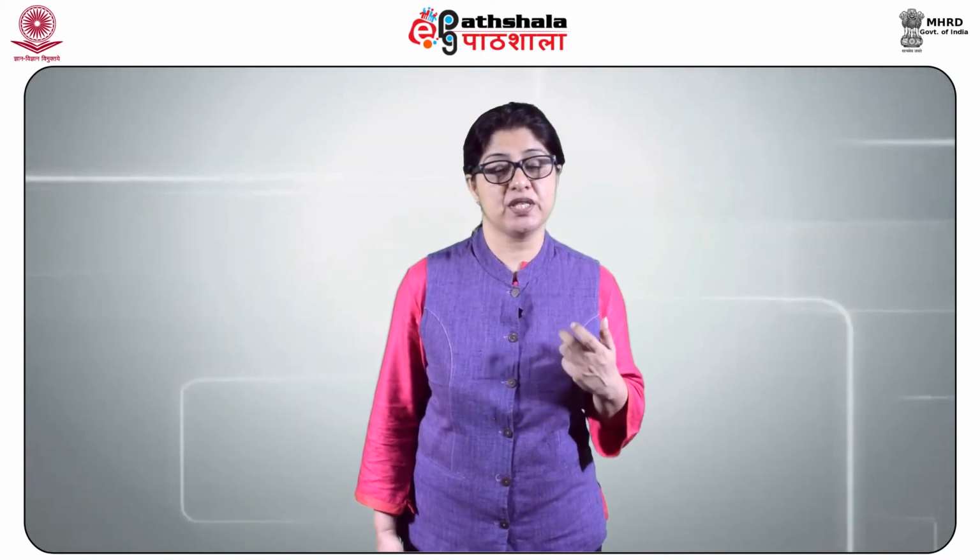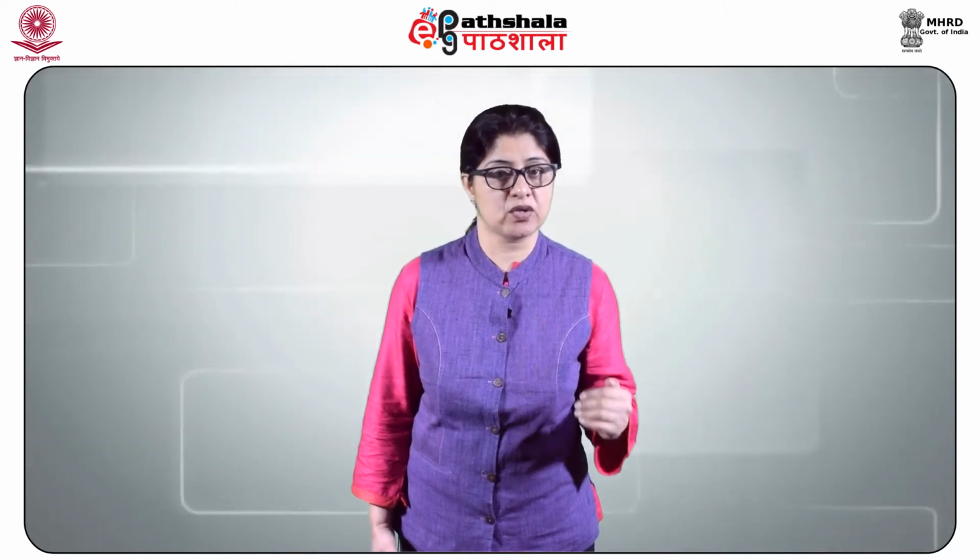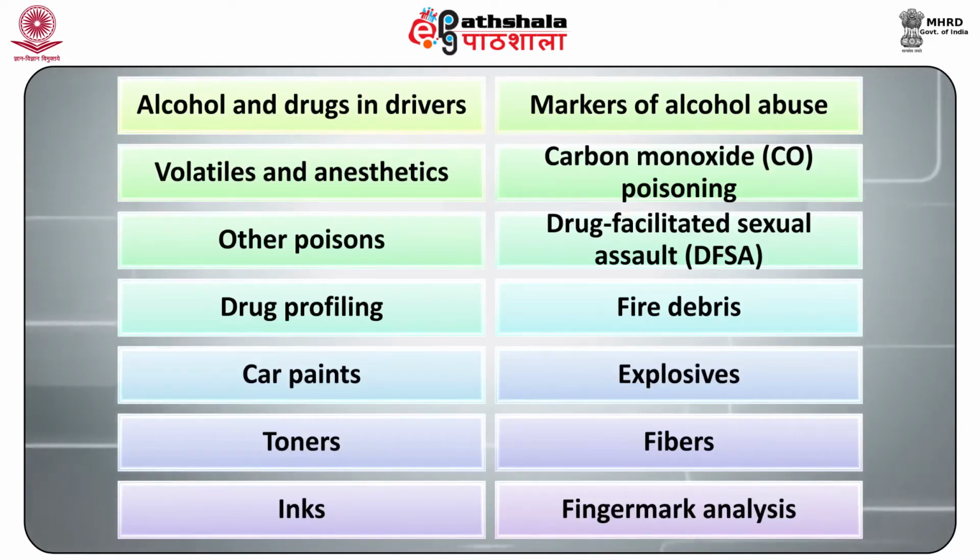Recent applications of GC in the forensic sciences include those in forensic toxicology, which include alcohols and drugs in drivers, markers of alcohol abuse, volatiles and anesthetics, carbon monoxide poisoning, poisons, drug facilitated sexual assault and drug profiling, and more general applications to criminalities in areas such as fire debris, car paints, explosives, toners, fibers, inks and finger mark analysis.